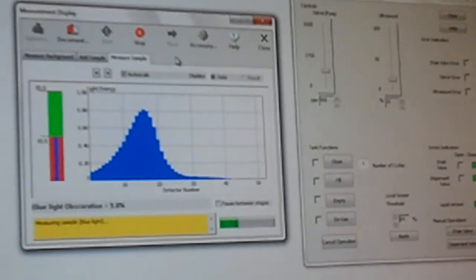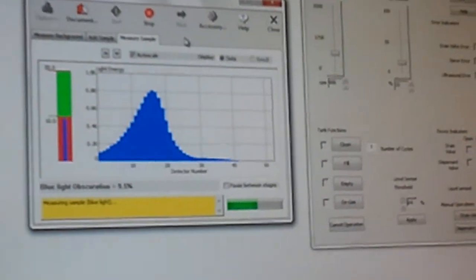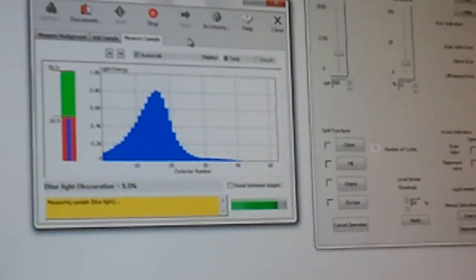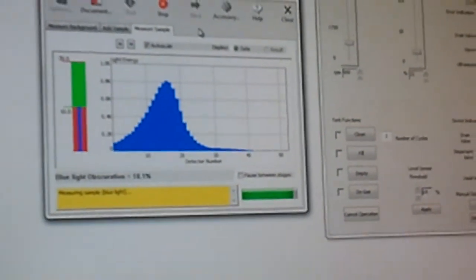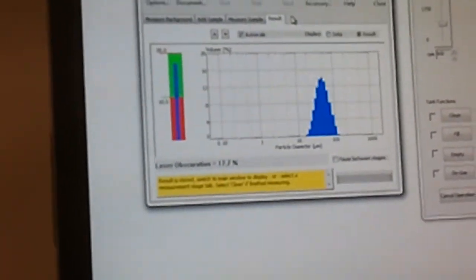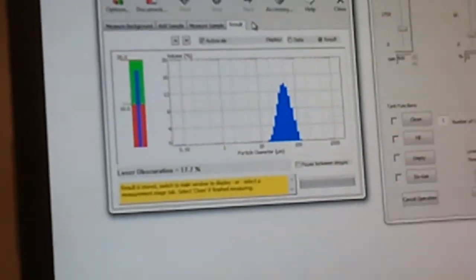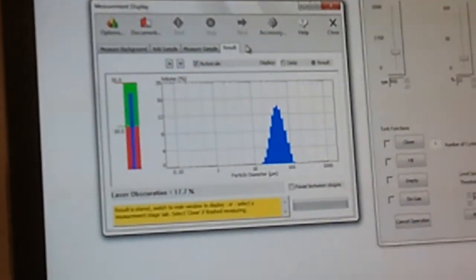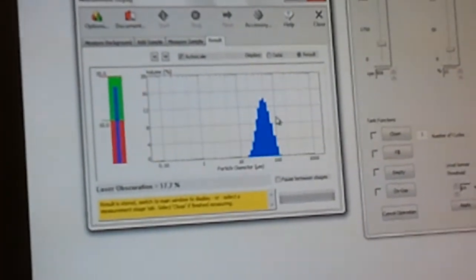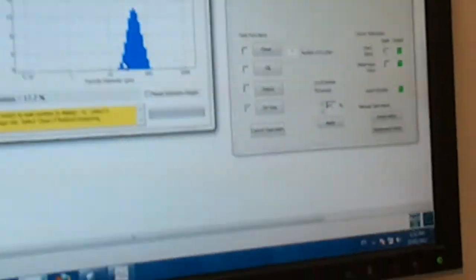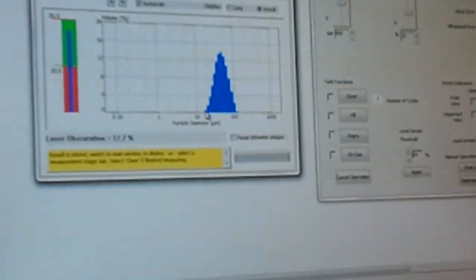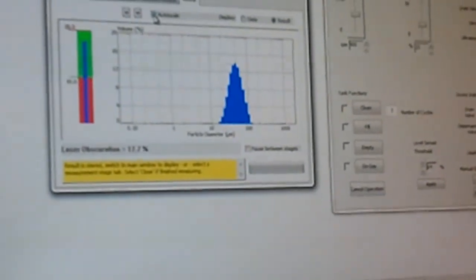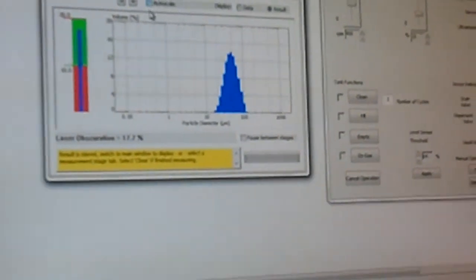So apparently the light has the normal light with laser and then the blue light or something. So this is the two. Okay, so here we have it. Your end result. And that's the distribution of my... And that's the distribution, right? So if you see, it says 45 to 70, I think. Yeah, just one shot. It says 45 to 75. And that's quite accurate. I mean, the peak is 75, right? Correct, so around there. Yeah, we can play a bit with the scaling.